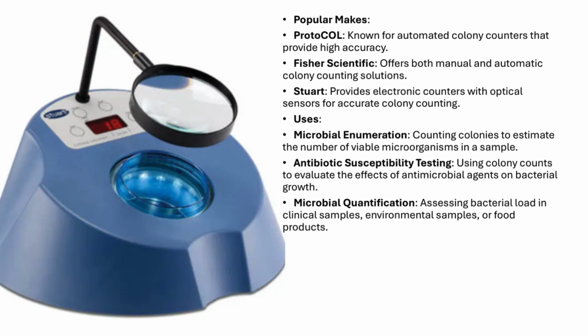Uses of colony counters in microbiology. The colony counter is widely used for several key microbiological tasks. Microbial enumeration. By counting the colonies, we can estimate the number of viable microorganisms in a sample, which is crucial for understanding microbial populations in clinical, environmental, or food samples.